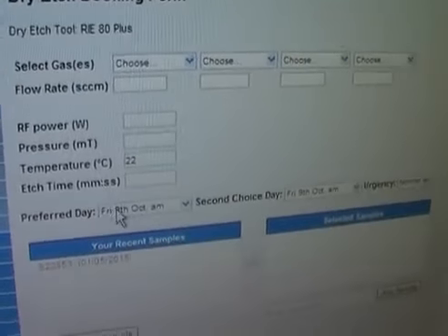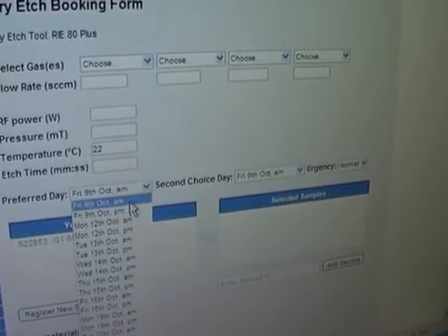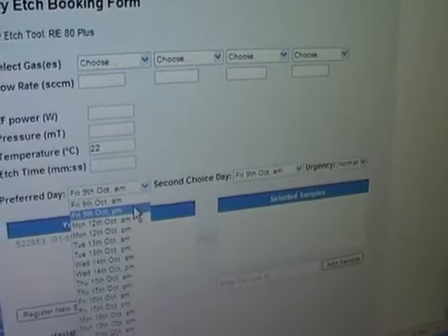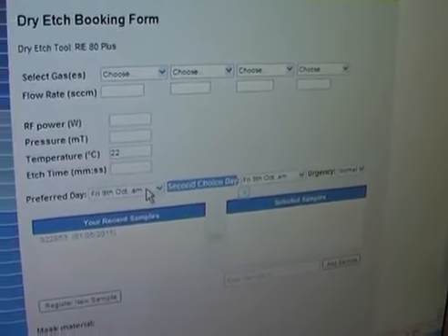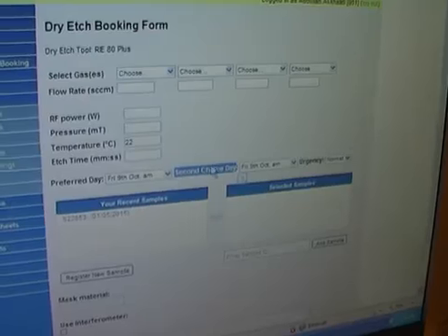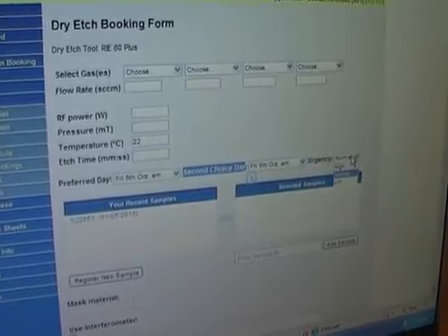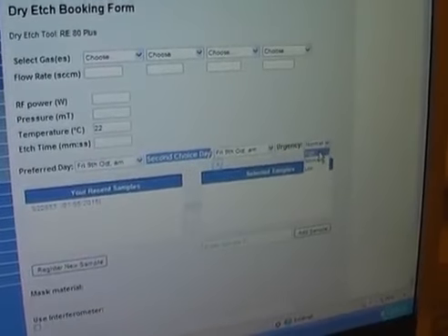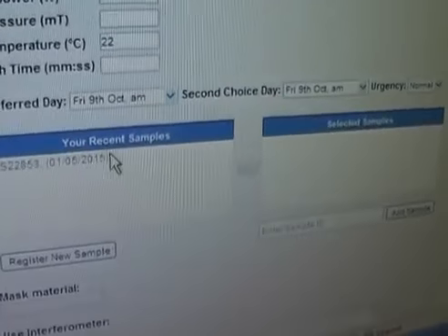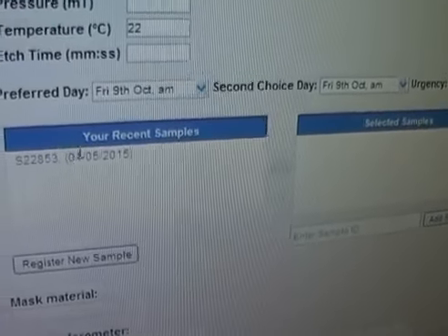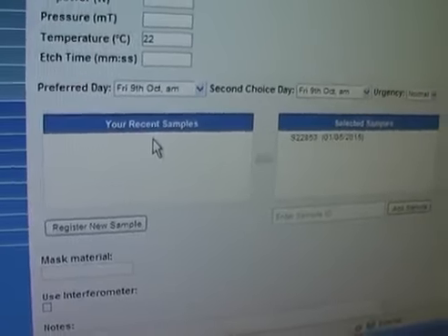Then we have the preferred day — we can choose any day and whether it's in the morning or in the afternoon. We should also give a second choice of booking, so that in case there are no time slots available, the technician can book another time. We can choose the urgency — highly urgent, normal, or low. We then select a sample from the database; in this case we only have one sample, so we select that.